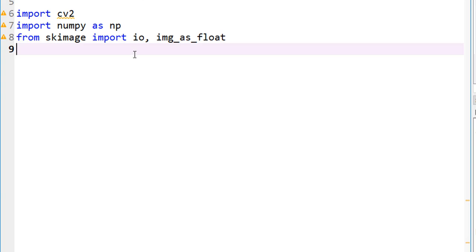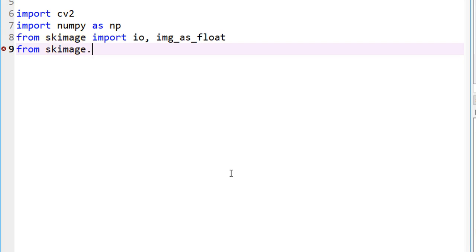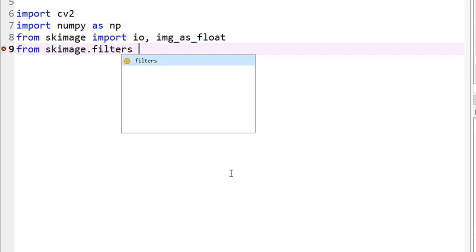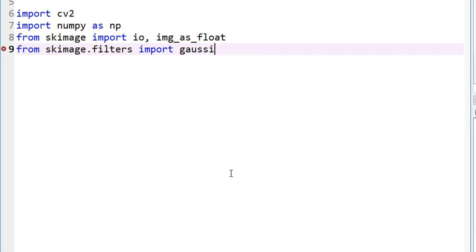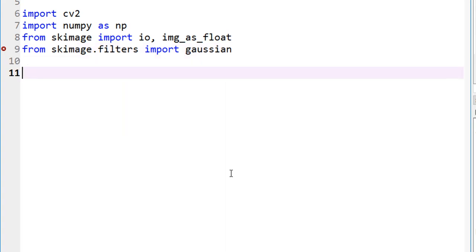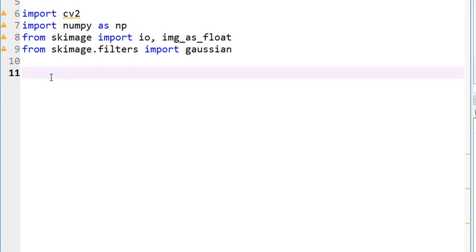While we are here, let's actually go ahead and import from scikit-image, the Gaussian is part of scikit-image.filters. Let's just import Gaussian so we can directly apply those. I'm importing entire CV2, so let's not worry about importing the Gaussian from CV2 yet.